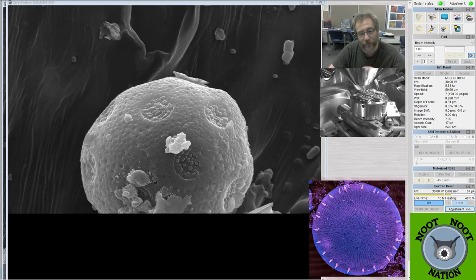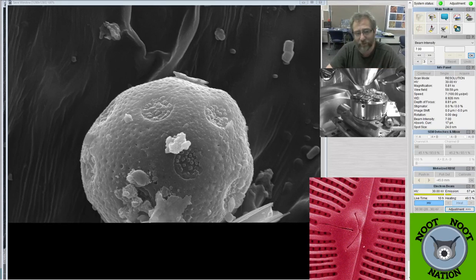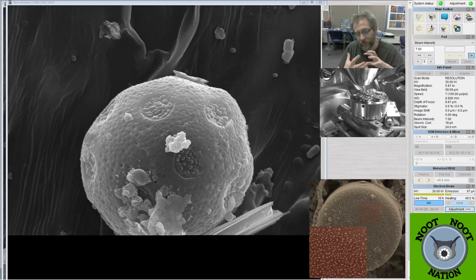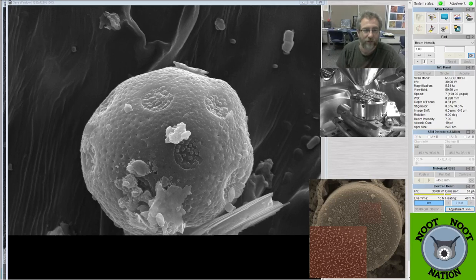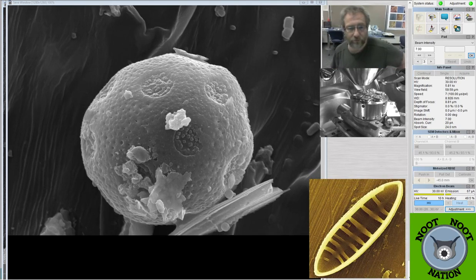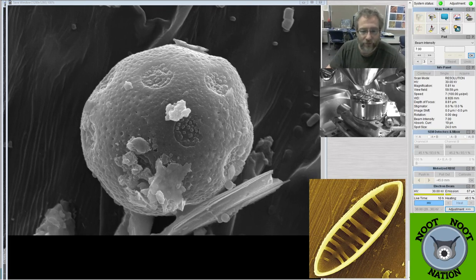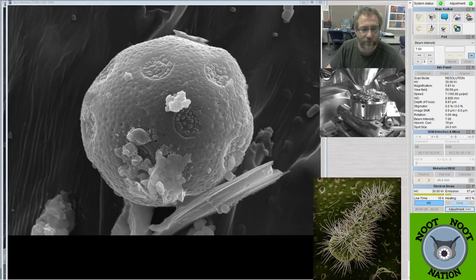A lot of pollen is determined by breaking them into the general shape. Does it have three folds or one fold, is it football shaped or are they round? They use that to basically get them into broader categories. As I mentioned, in his class on microfossils we looked at pollen a little bit, and I have a guidebook that probably should get me kind of close as well. So if Chad doesn't know, I can look through that.